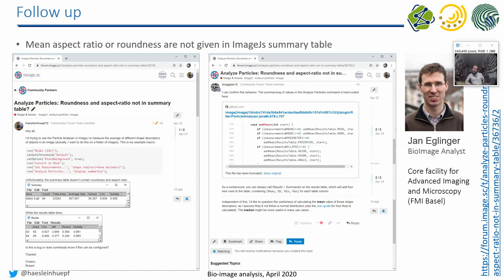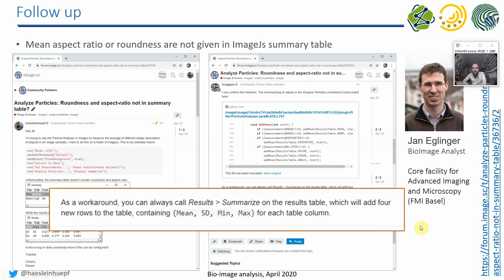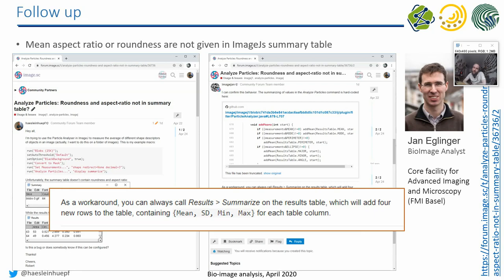I got an answer from ImageJan. So ImageJan is Jan Eklinger, a bio-image analyst from Basel. He was mentioning that yes, that's a problem. He's actually pointing us to the source code where the problem may be. And furthermore, he is pointing us to a workaround. So instead of using the summarize checkbox in the particle analyzer, you can get the normal results table and then summarize it yourself.